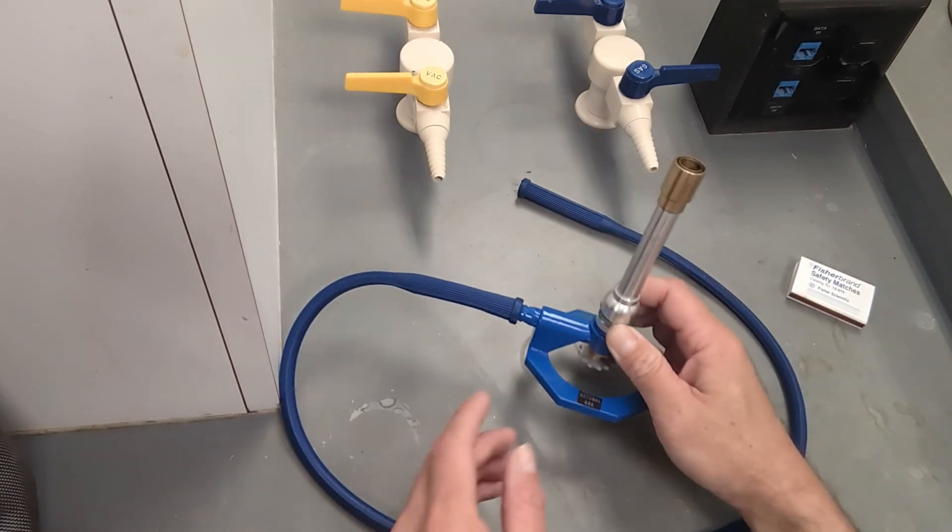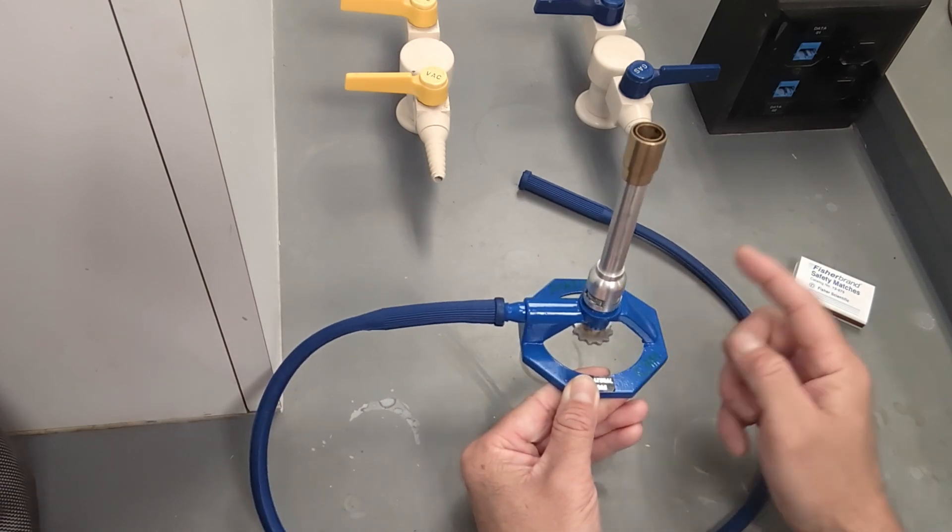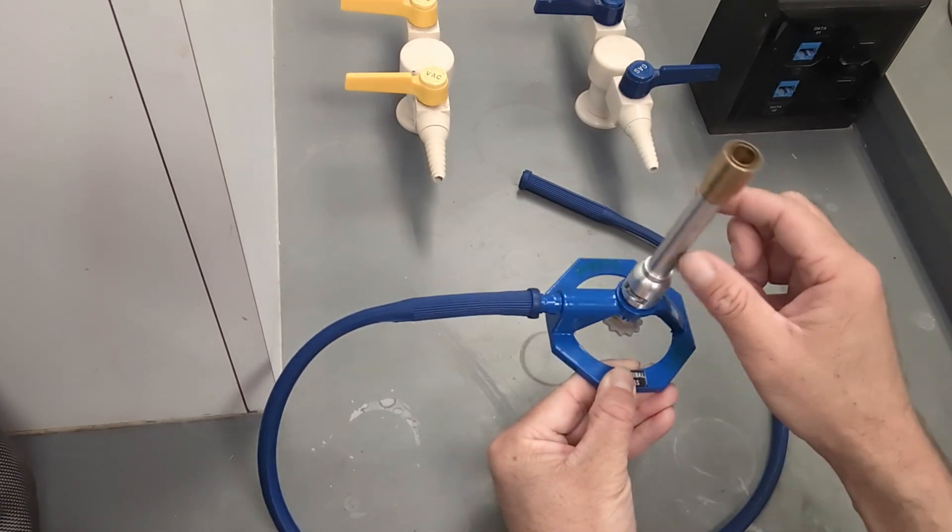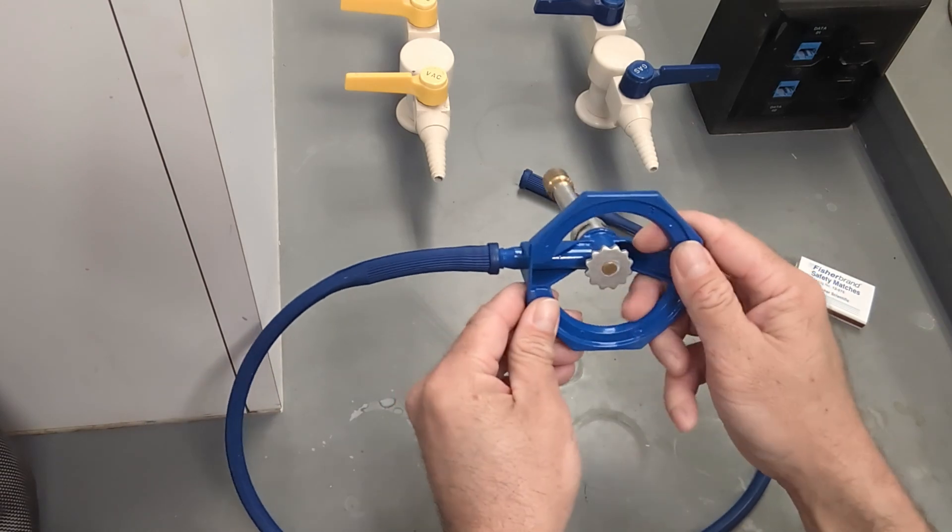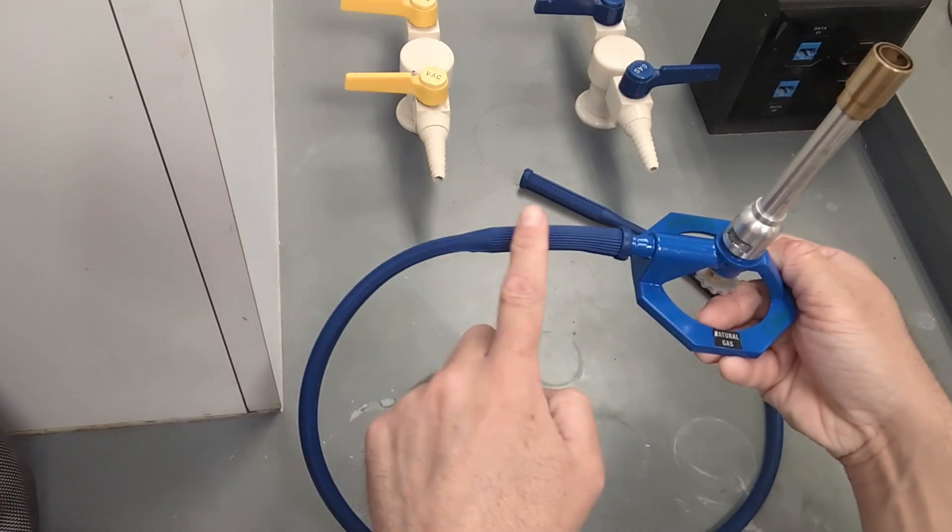The Bunsen burner consists of several parts. The base holds the entire Bunsen burner steady. The collar above is used for air flow and the stopcock below is used for gas flow.